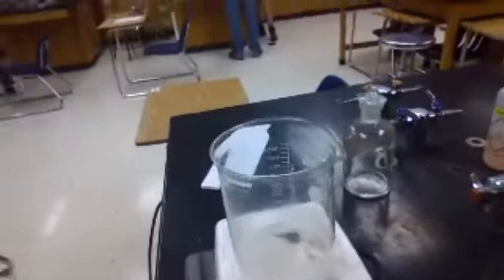So we need to find percent by mass first, which is mass of solute over mass of solute plus mass of solvent. Wait, we don't have the mass of that yet. He told me to set up the equations, but we don't have the information, so it's fine. Ooh, it's evaporating. I don't know if you guys can see that, but it's smoking out. It's kind of cool. So I'm just gonna wait until most of it evaporates. I'll come back.